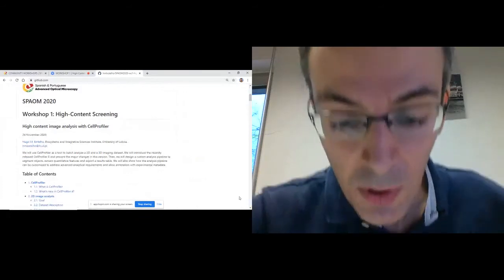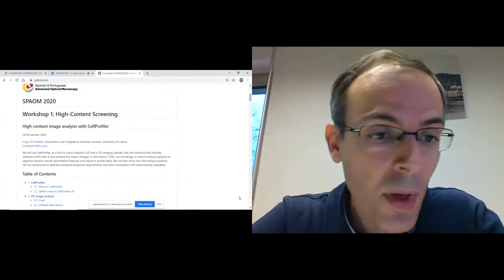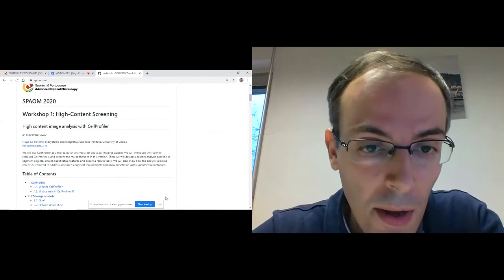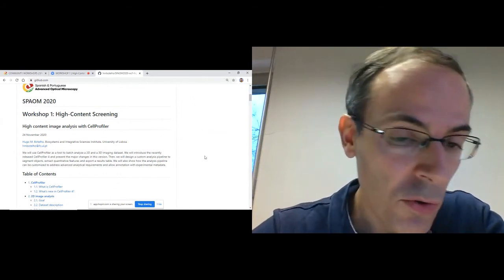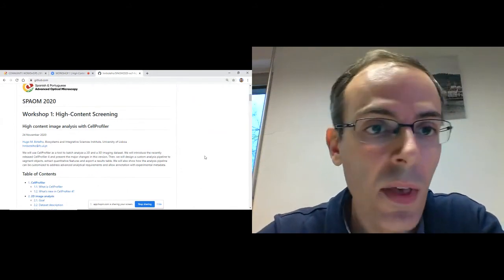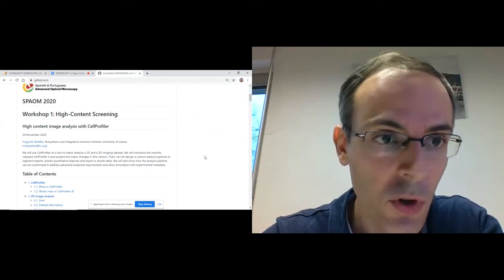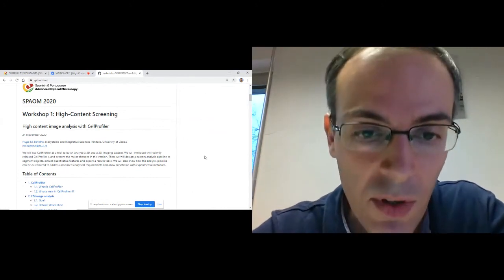So if you want to follow along this workshop, either right now or at a later time, I've left some notes about what I'm going to show you, as well as the imaging data sets and the CellProfiler files in GitHub. So if you go into the description for this workshop on the SPAOM website, you have the link for this GitHub repository.